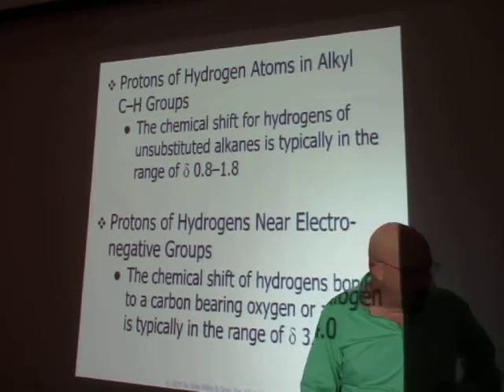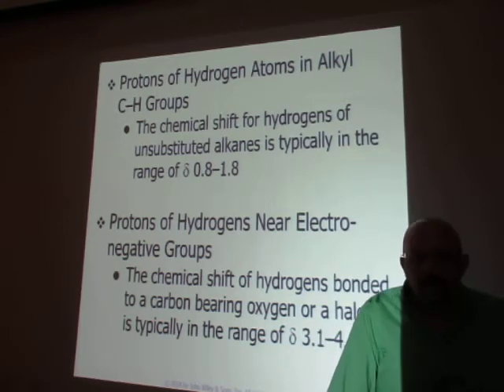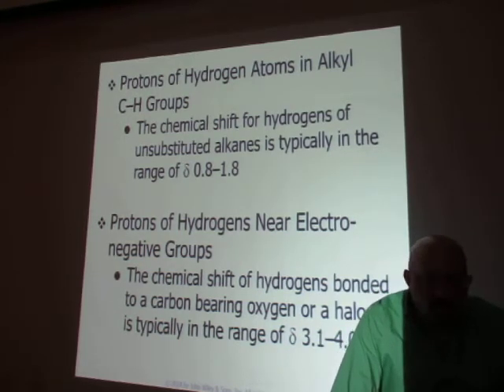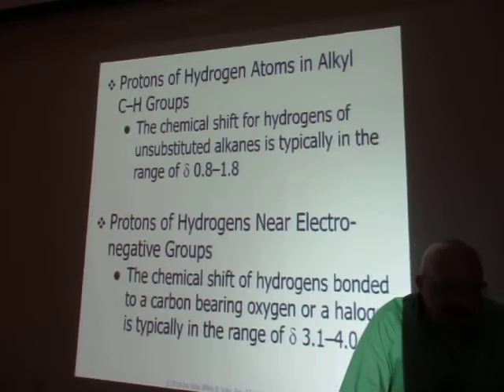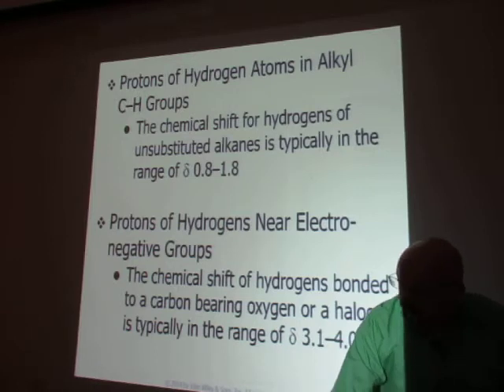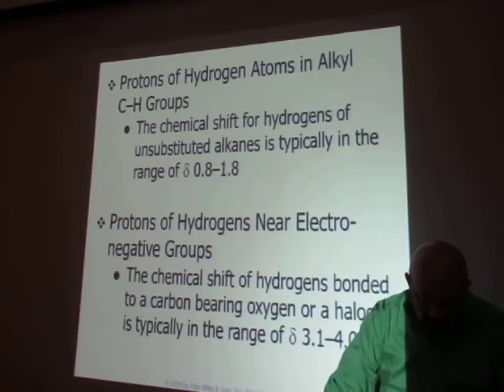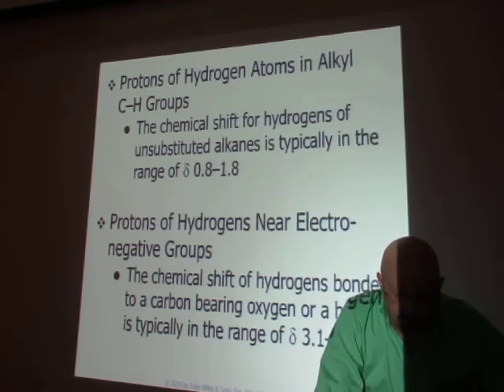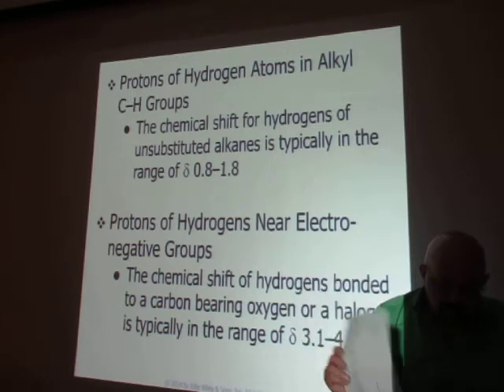Okay, if you have a normal alkane proton, you've got nothing else in there except just a normal alkane. You don't have any carbonyls or double bonds or bromines or anything like that. Just a normal plain alkane. Normal alkane protons come from about, I don't really like the numbers that are here in the slides. This is just what came with the textbook. I remember 0.5 to 1.5. That's easy for me to remember. 0.5 to 1.5, and that's what I've got there on the little summary chart.